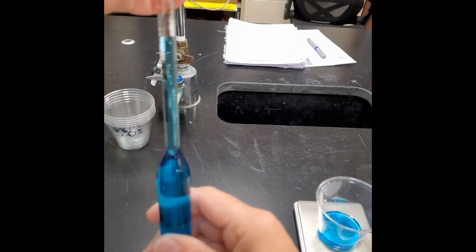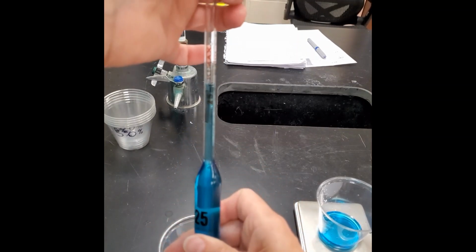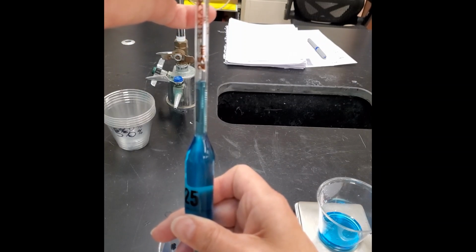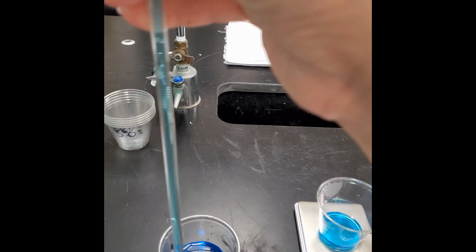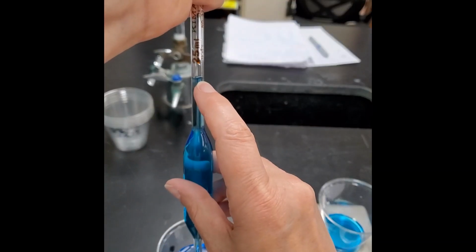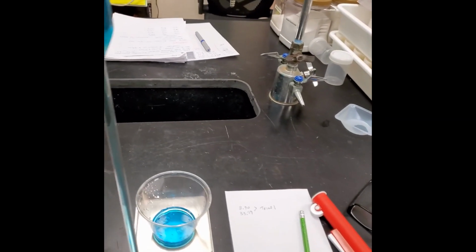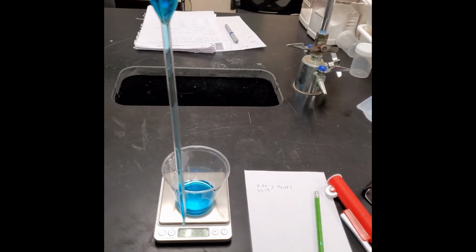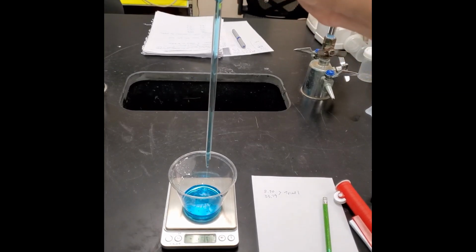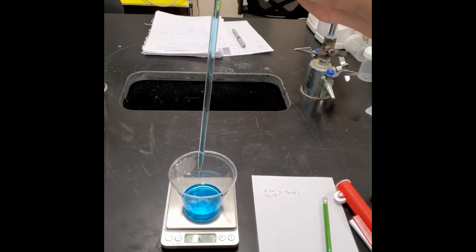And then I am going to let the liquid, while holding it over the cup, drain out. So I went way too fast with that. I drain until the bottom of the meniscus is even with this line, okay? Then I come back over here. I do not have to re-zero the balance. I just add it and record whatever mass it is for my second trial.